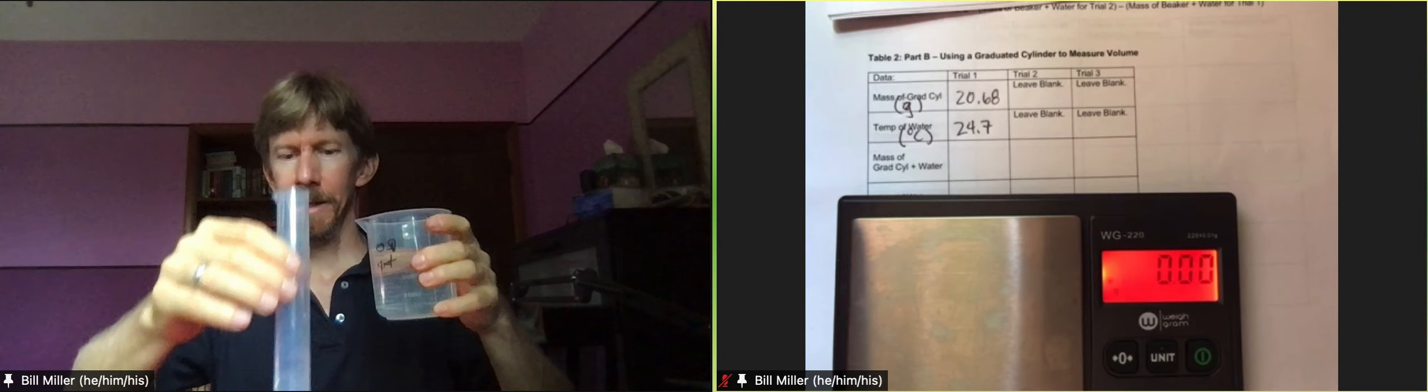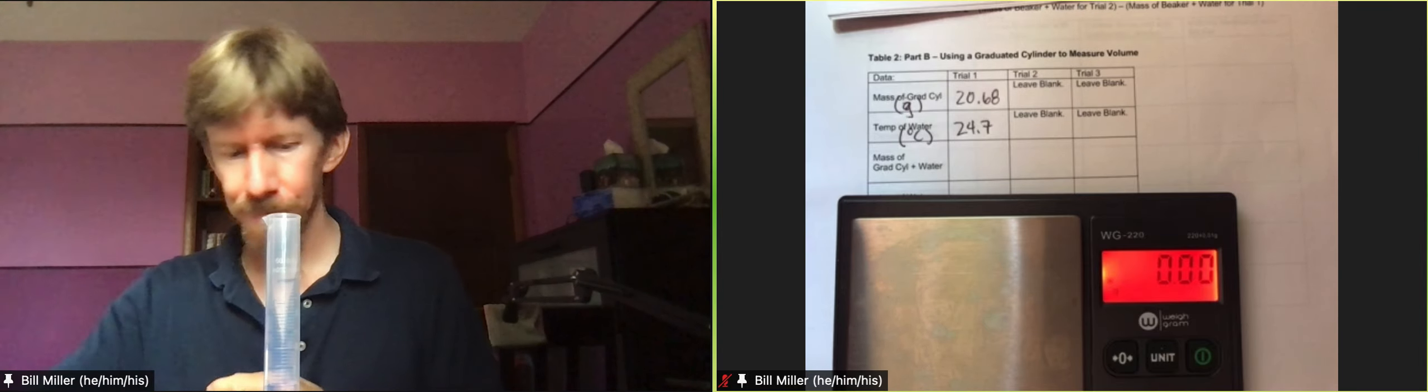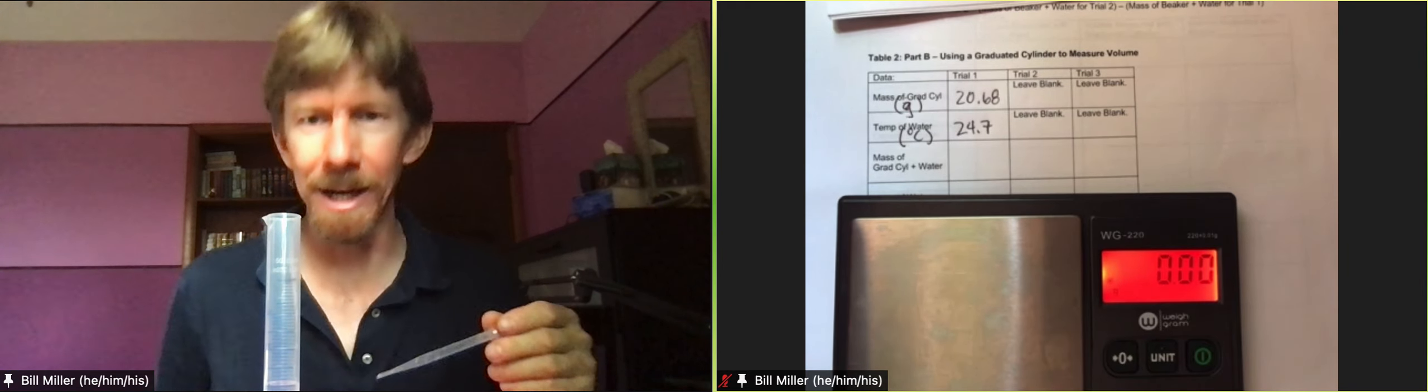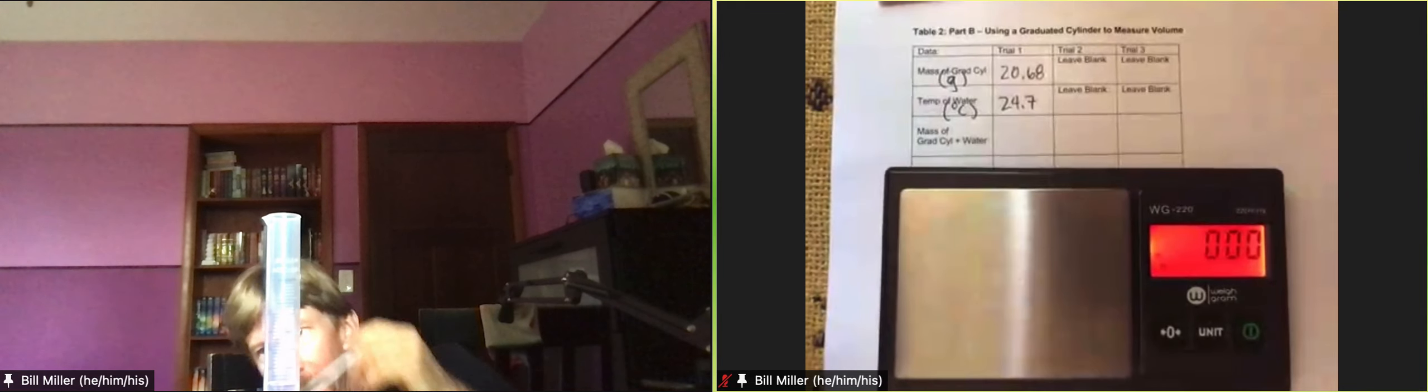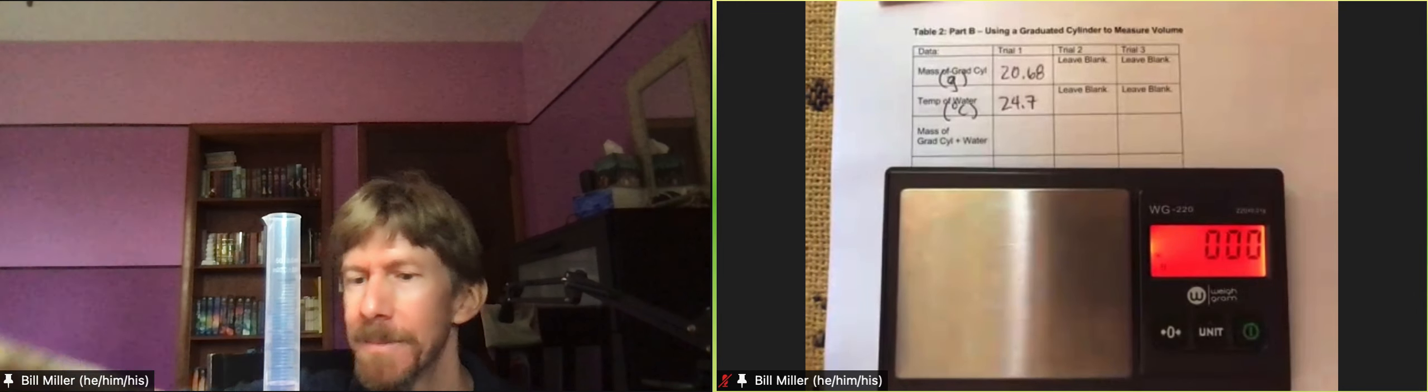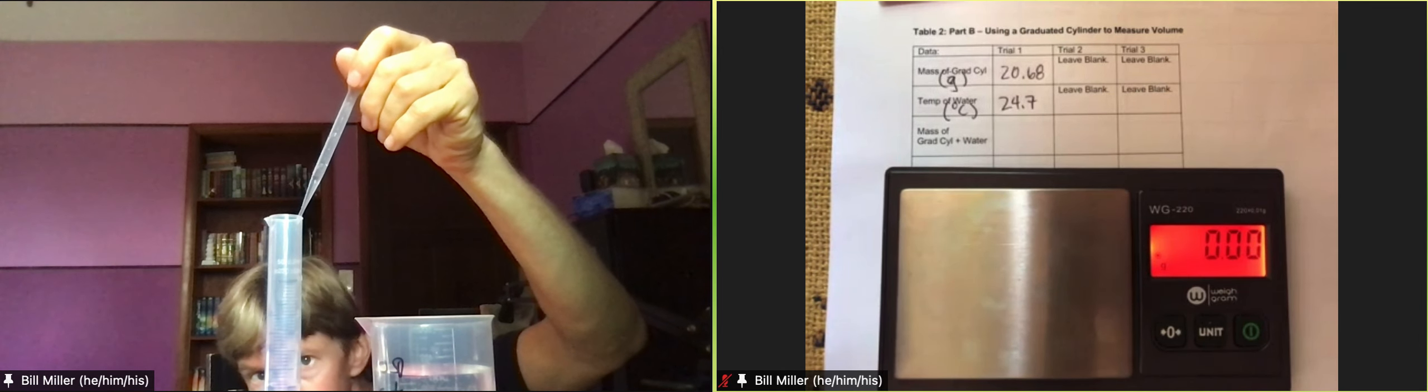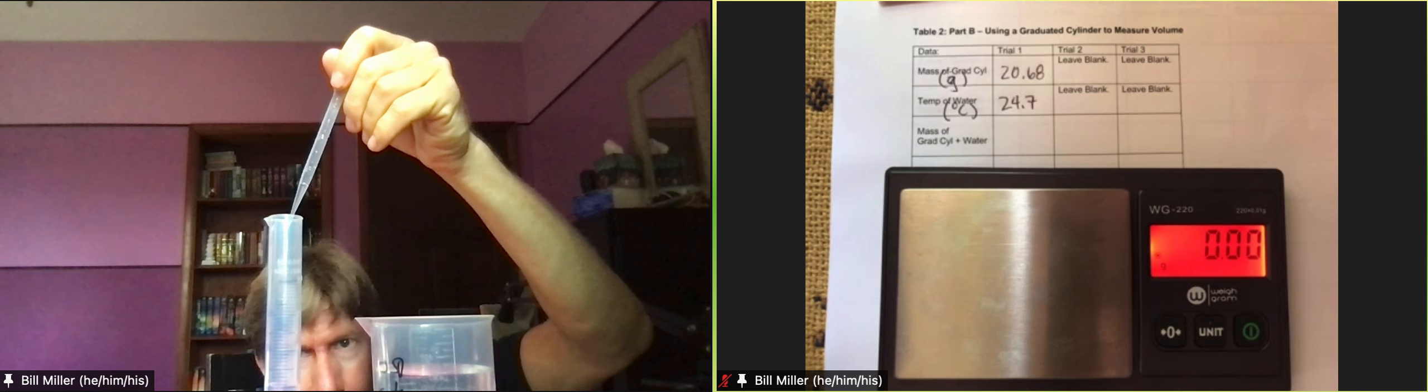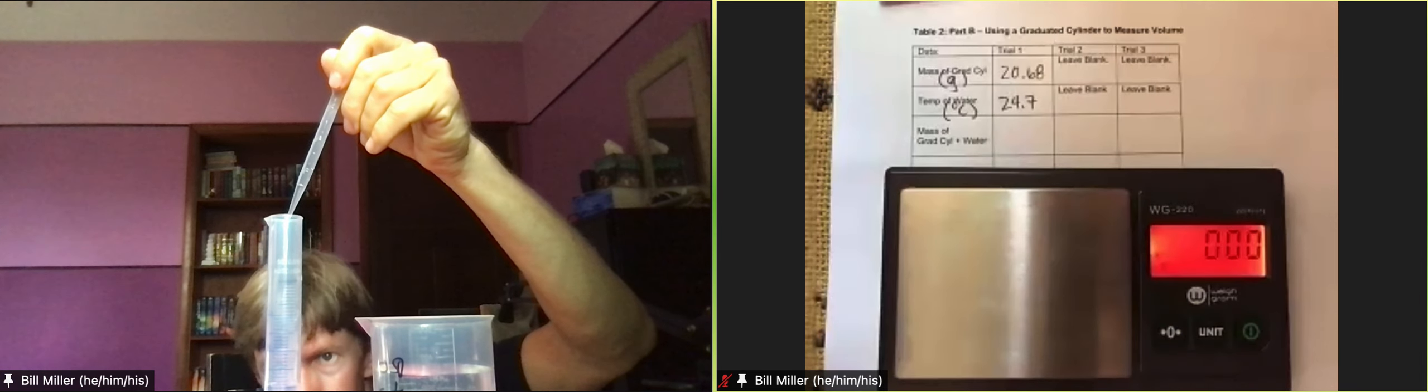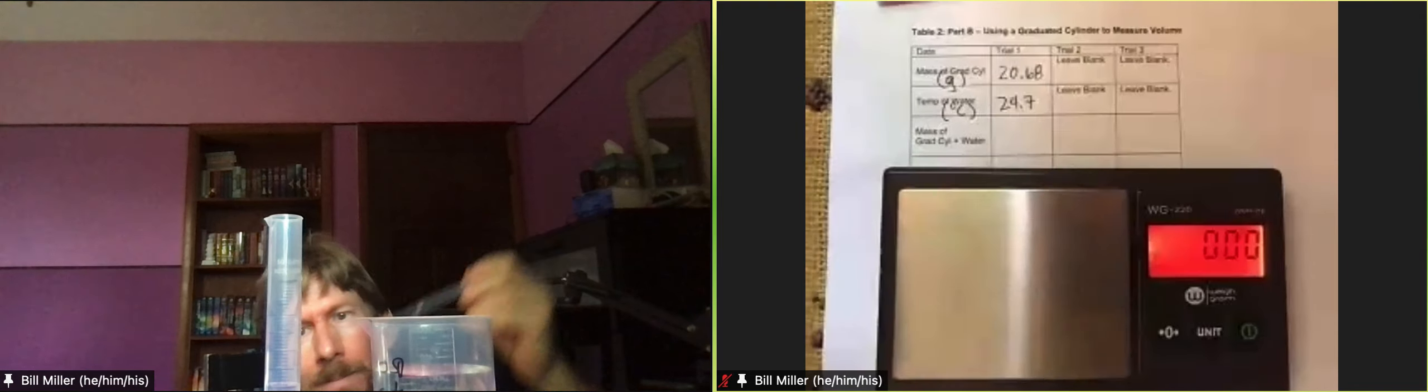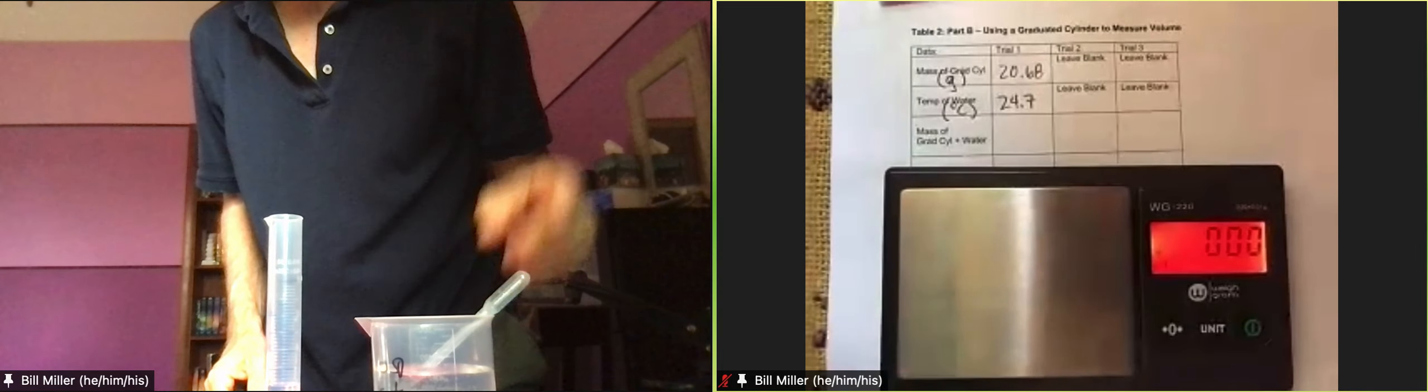What I'm going to do is use droplets to get it exactly to 20, and you want to look straight across at the 20 line to line it up exactly. So mine is a little below the 20 line, so I'm going to get it right at the 20 line, and I'm just going to leave my pipette in my water there.